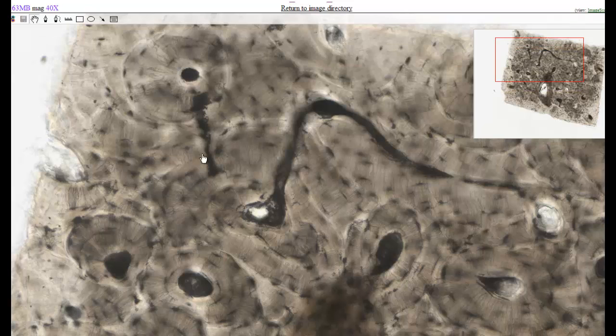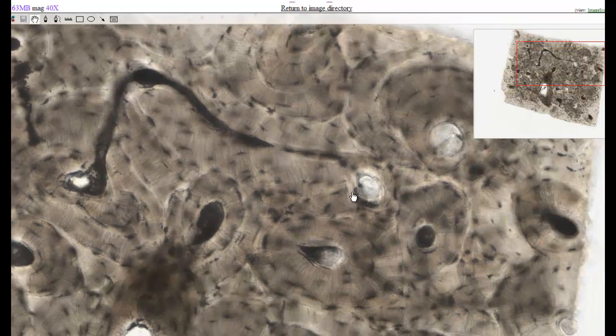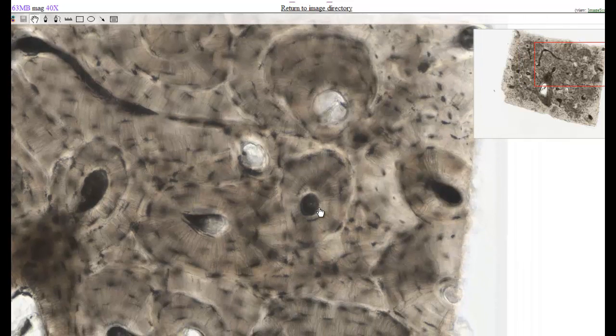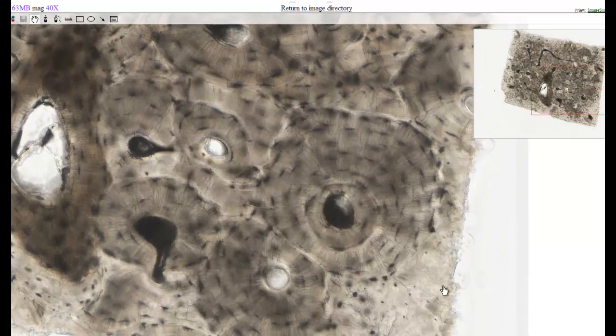If you labeled this bone, you could label it as osseous tissue, that would be just fine. And I hope that you should be fairly confident with being able to identify bone after this image. Okay, we are going to pick up next with nervous tissue and then finish with muscle tissue.